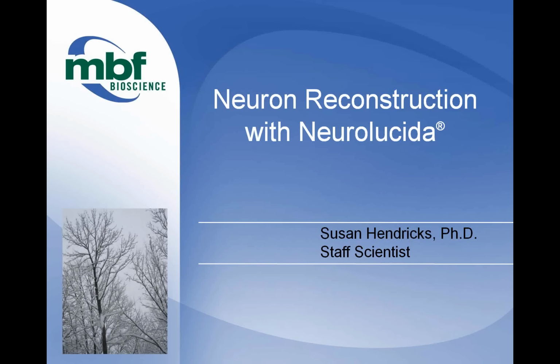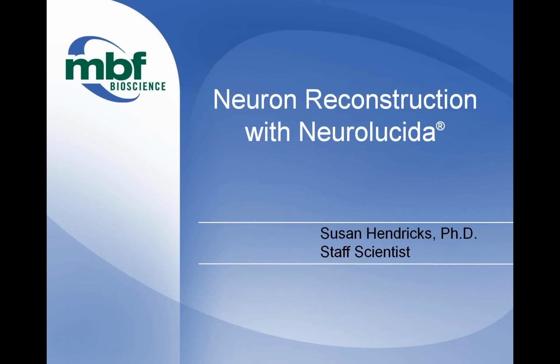Today I'll be demonstrating how to perform neuron reconstruction using Neurolucida. At this time, I hope everybody can hear me, and if you need to, adjust the volume of your speakers. My voice isn't as loud as that test voice, so you may need to turn up the volume.